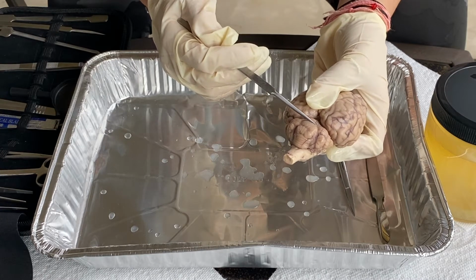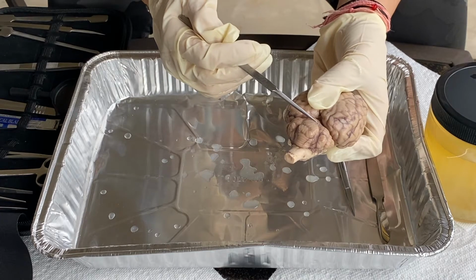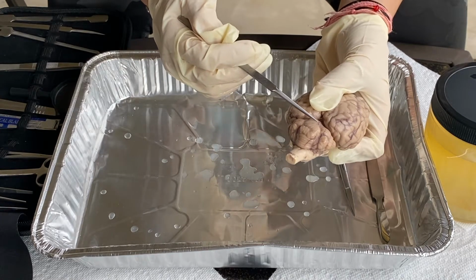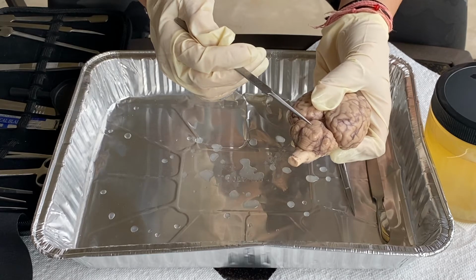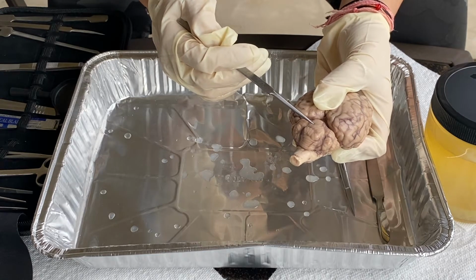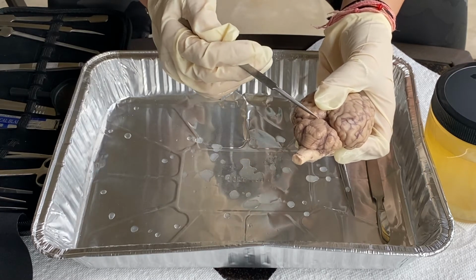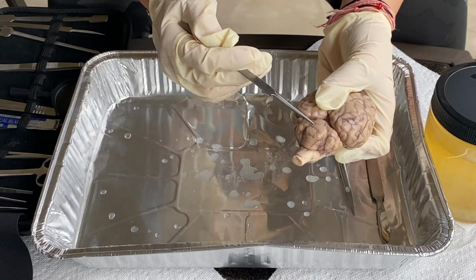And finally, it's involved in some of the motor learning because the cerebellum actually helps the body learn movements that require practice and fine-tuning. So for example, when you're learning to ride a bicycle or play a musical instrument, the cerebellum plays an important role in muscle memory for this.